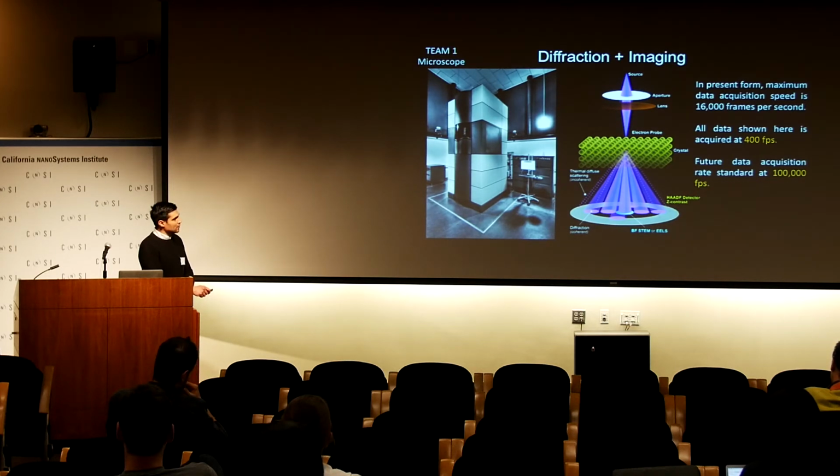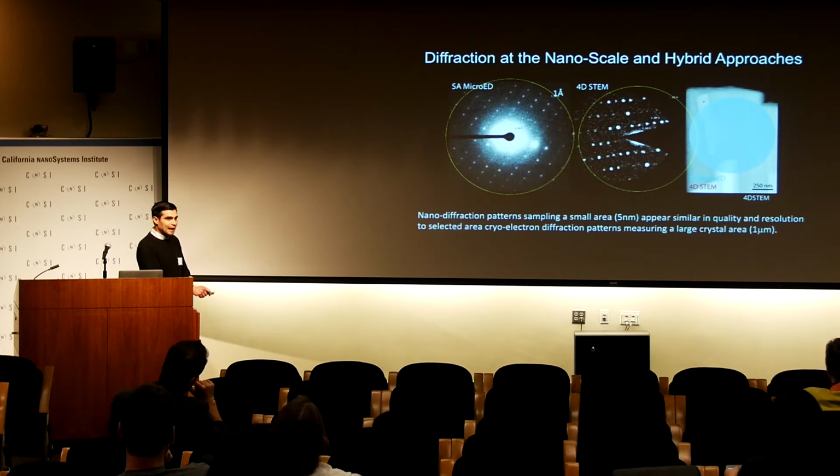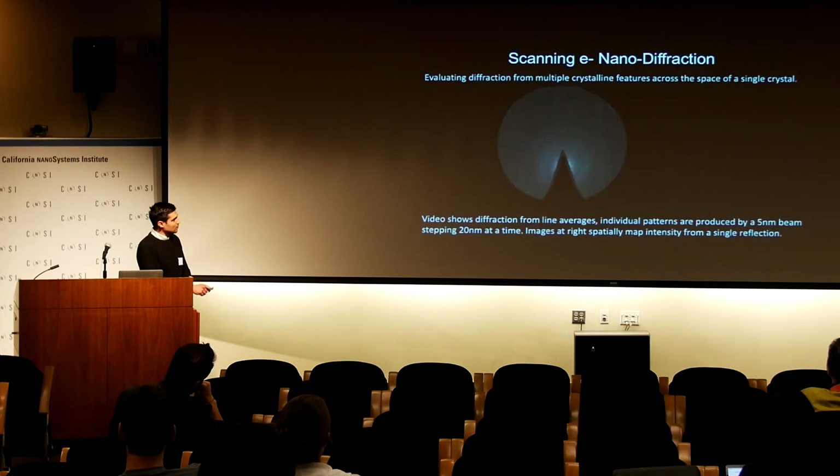And the reason why it becomes more complicated is that we're no longer just integrating spots. The types of spots that we see here, because of this interesting geometry, look a little bit different. So they look almost like circles here. And within the spot, you actually have additional information other than just the absolute intensity. You have information about the substructure within the beam. So this is the type of movie that we would record.